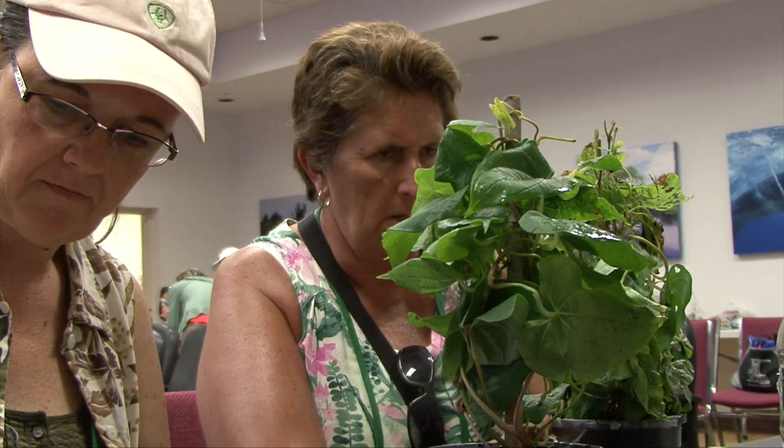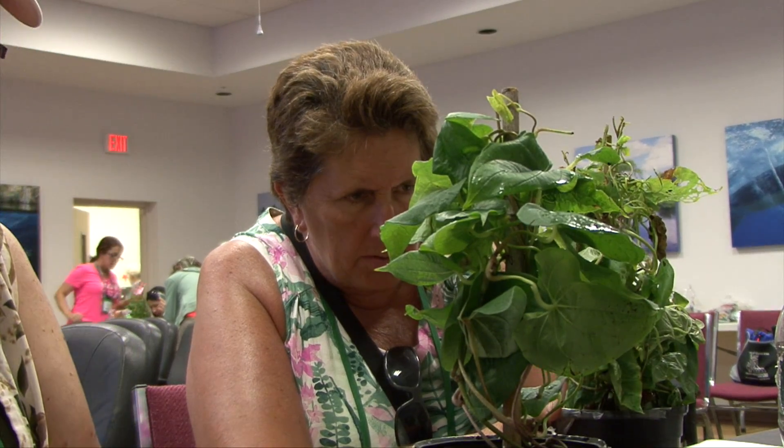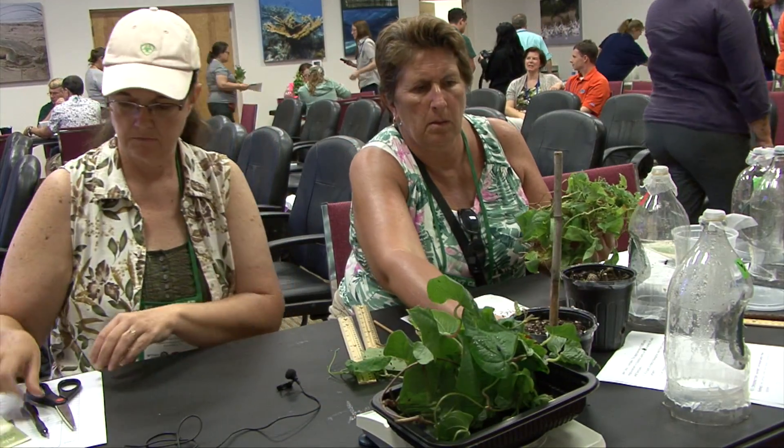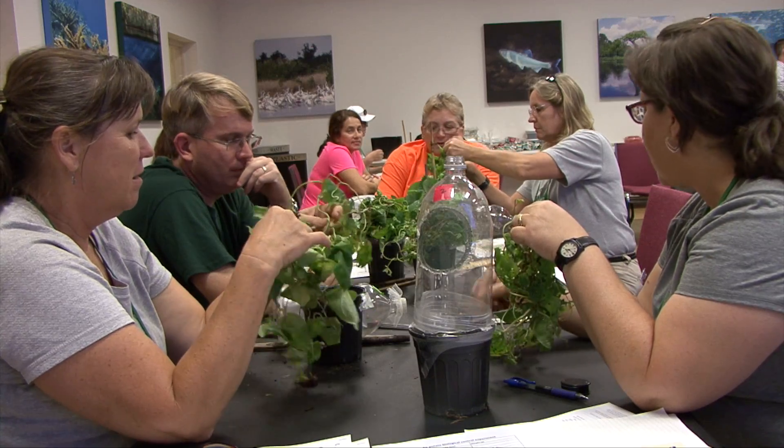You take half your plants and put beetles on them. You take the other half of the plants, leave them without beetles. Put the beetles on, wait a week or so, and then you can measure your plants. That's exactly what we're going to do today.